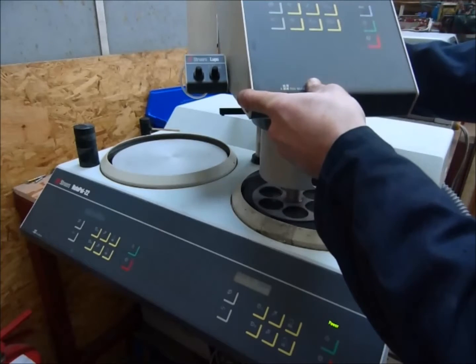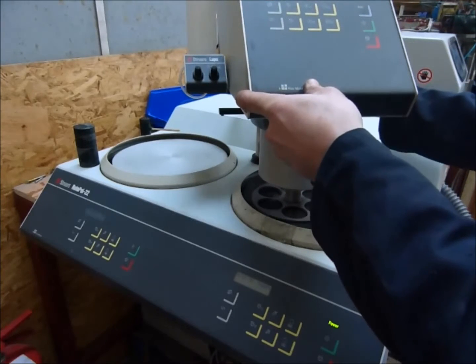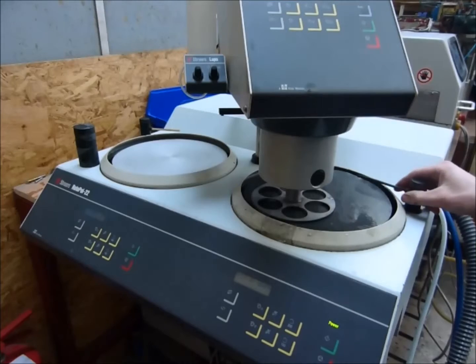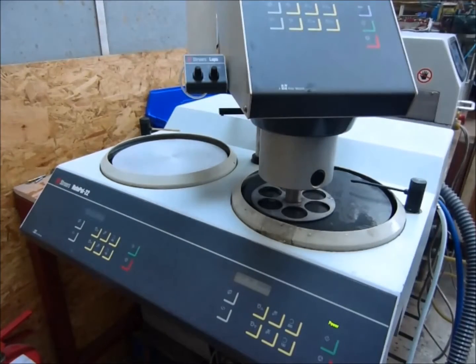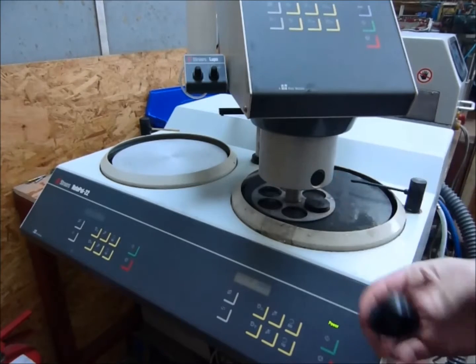Blow the head down and lock it into place. Water there. Placing your samples in the holder.